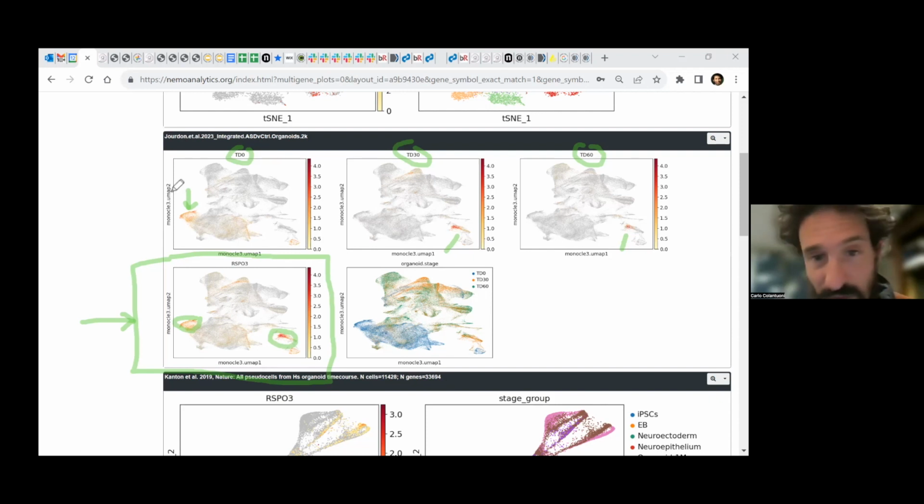There's also notably a little bit later up here in the UMAP. I don't know if you can all see that, it's a little small, but you can zoom in if it were on your own machine. So just to point out the kind of thing we can see here, this is separated by time. We could also separate it by autism and control.